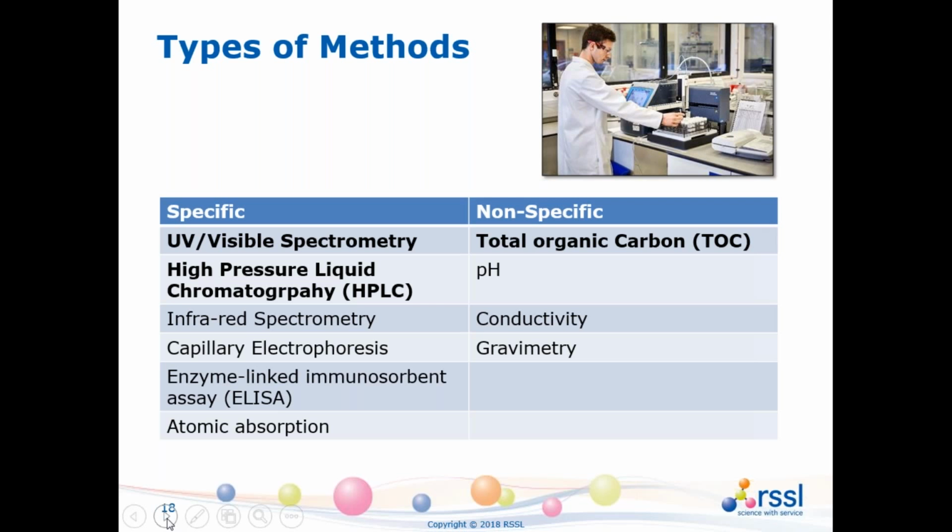However, if you've got a fairly new process, you need to be identifying individual analytes, particularly if you've got particularly toxic materials with low limits. You need to be first getting a handle on and controlling your process. And once you've controlled your process and can consistently demonstrate you're achieving less than the residue limits, at that point you may decide, well, if my analyte can be detected, for example, by total organic carbon, then we could move to that, since it's a much cheaper technique to run.